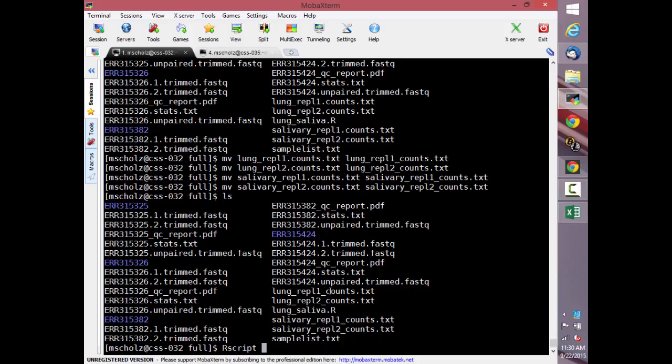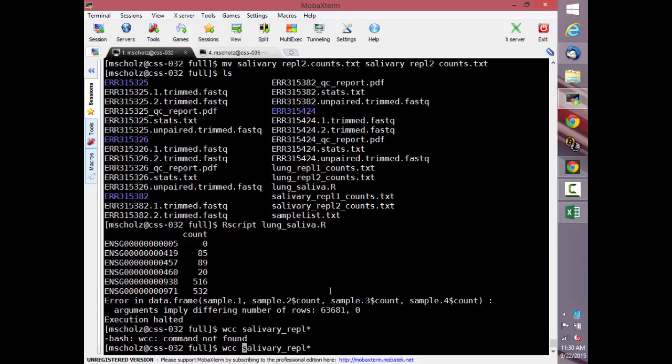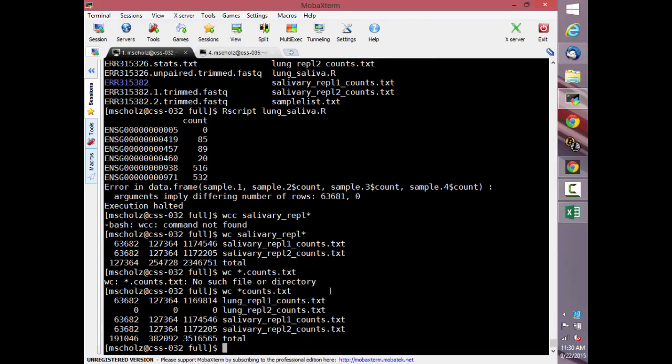fine, which means that it's not going to because I'm trying to show all of you this live. Well, that's a problem, isn't it? So we have a problem, which I'm going to ignore by pretending that there's only one lung output. Apparently my lung output didn't finish last night. So we are going to do 3 instead of 4.